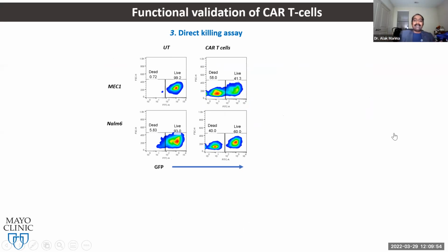We just co-culture them, and here you can see that we use flow cytometer, where those target cells are labeled with GFP. You can also image those with microscopy, but we did flow because we also plan to view under a microscope. But this was the easiest presentation for us to find how many cells have been killed by the CAR-T.